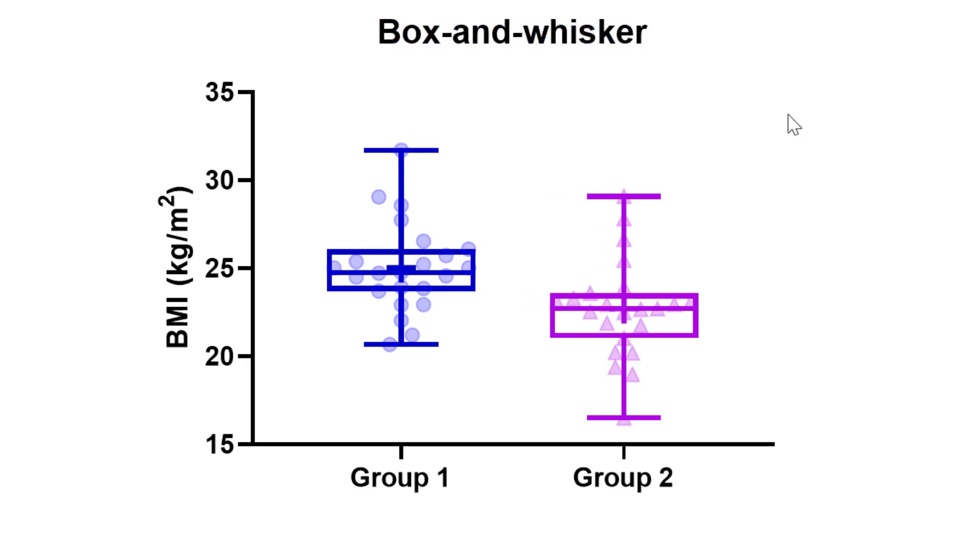Another thing that you may wish to add onto this graph is lines and symbols to represent areas of statistical significance. For example, showing an asterisk in between these two groups. The ability to do this is explored in more detail in a separate quick tip video tutorial.